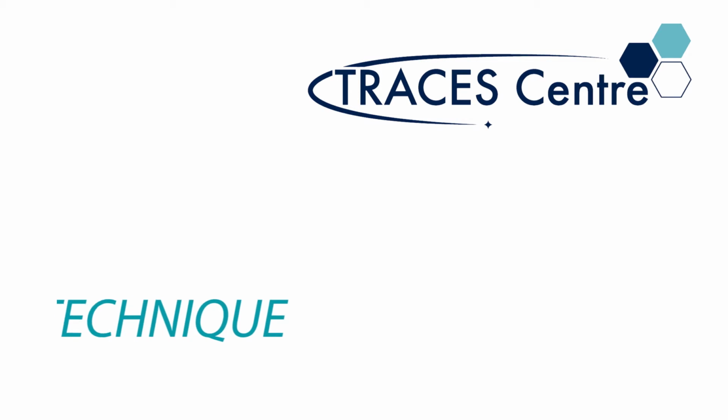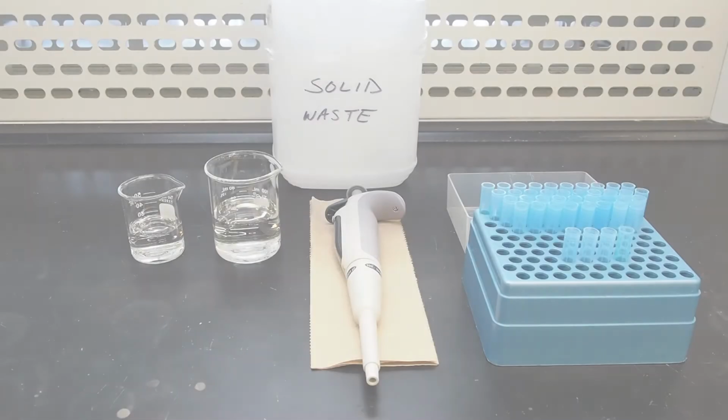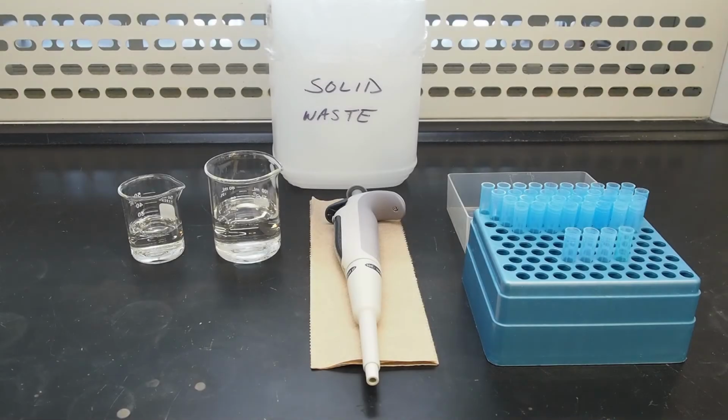Welcome. In this video, we will be demonstrating the proper technique for accurate micropipetting. Micropipettes are very convenient tools for the accurate transfer of small volumes. There are a variety of different types of micropipettes that service different needs, and there are also several pipette manufacturers that offer different design features and functions.